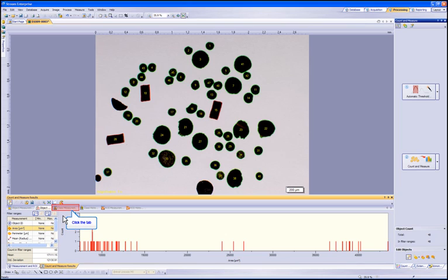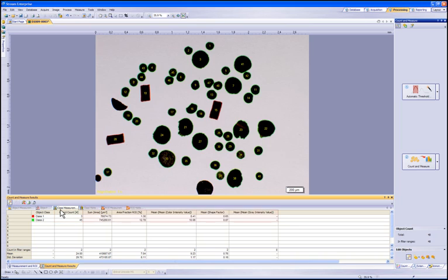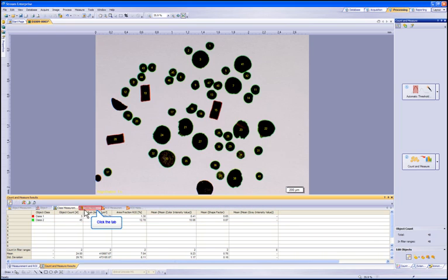The next window will show the class measurements we set up. This provides details on individual classes. Class 1 is set up based on a mean shape factor. This allows the particles that are rectangular in shape to be in class 1 and the round particles in class 2. We can show the object count for each class along with any measurement value we would like.